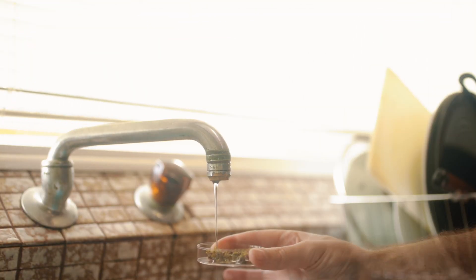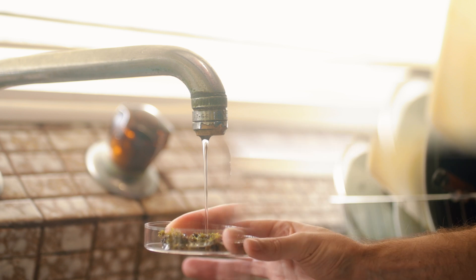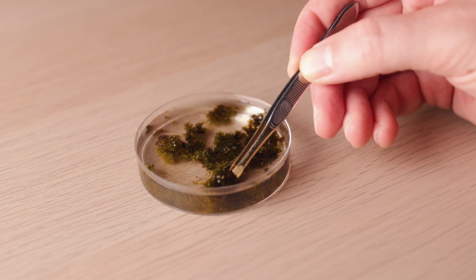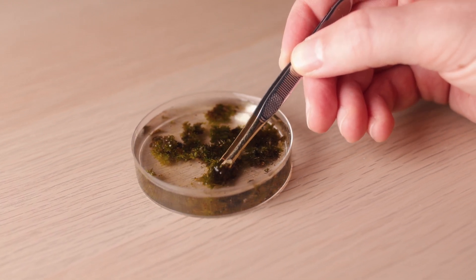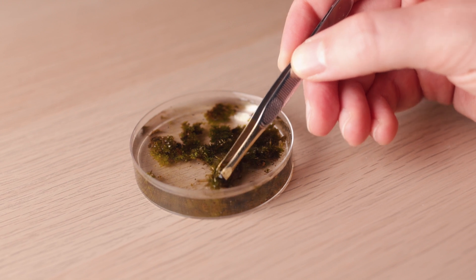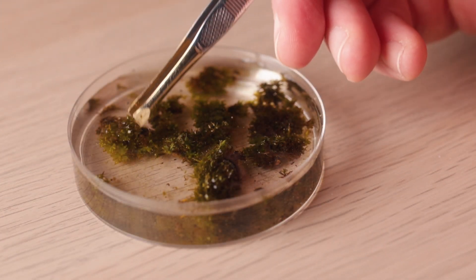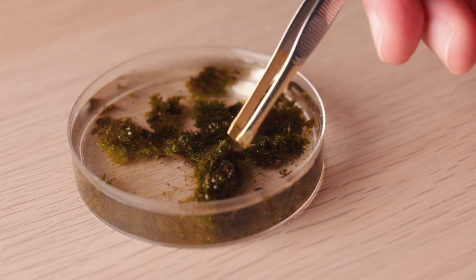The next step in my preparation was hydration of these samples, so I added a bit of water. This will make the substrate more loose and help you spot not only the tardigrades, but other microscopic animals as well, such as nematodes and rotifers. Make sure that most of the moss is fully submerged in water as well, then let it rest for a few hours or even longer.